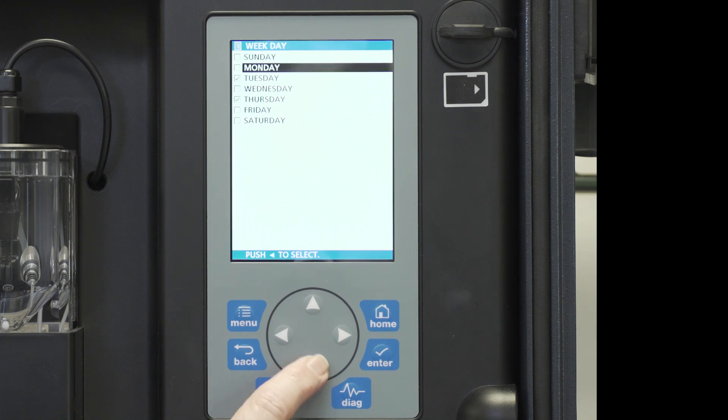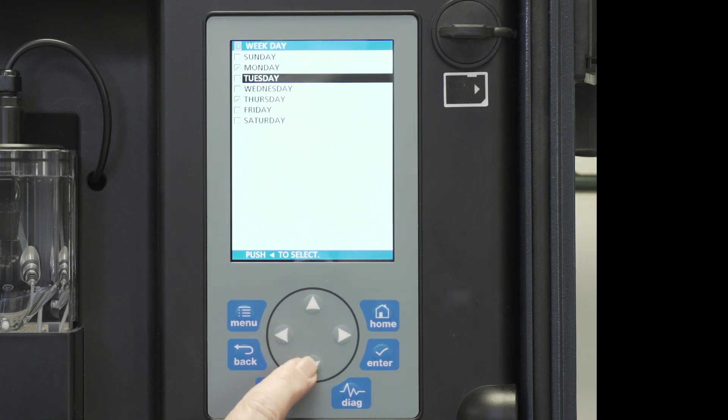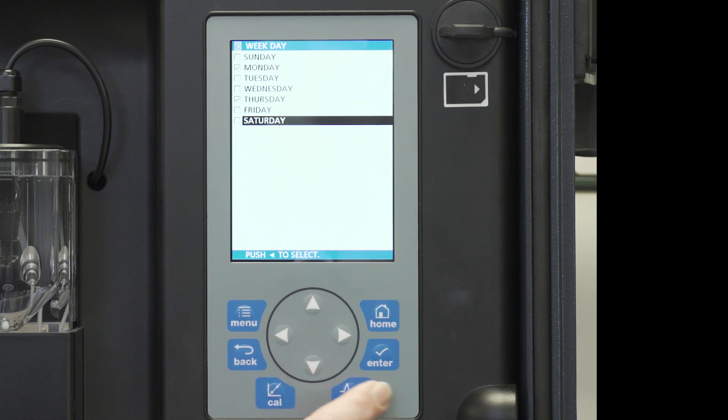So I scroll down to Monday, hit the right arrow key. I want to deselect Tuesday. Wednesday has already been deselected. Thursday is what we select. And we press enter.